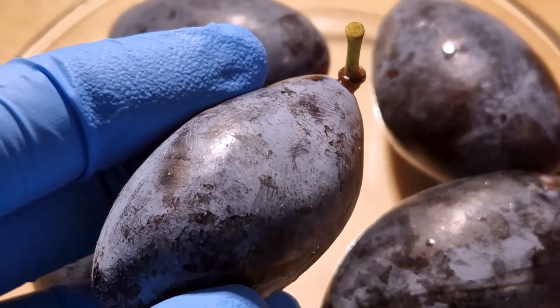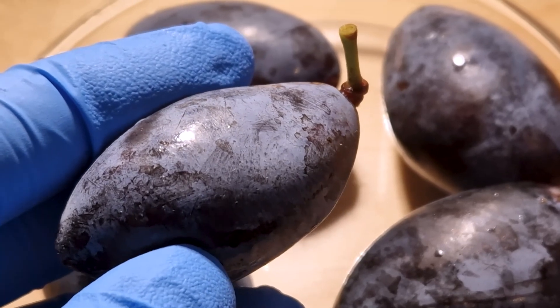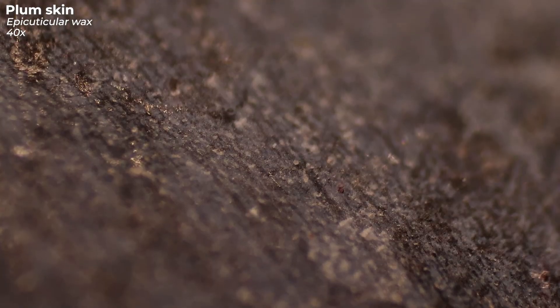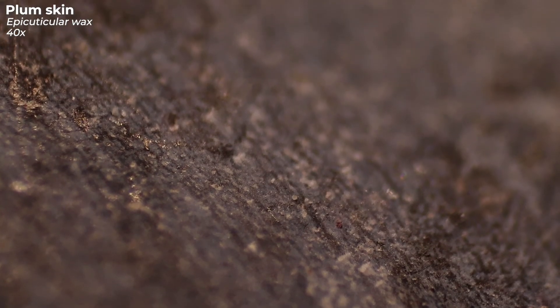Many consider the dusty white coating on the skin of the plum to be mold. Some even think it is pesticide residue. In fact, however, the coating is epicuticular wax, also called wax bloom. This coating protects the fruit from drying out, for example. The small white transparent crumbs you see here on the peel are parts of this protective coating.